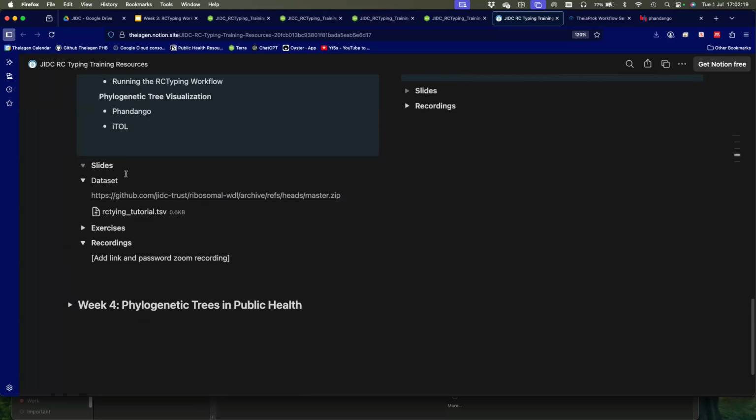Hi, Rotimi. You missed my question. I typed it on the chat box. Whether we might use this for speciation. Well, of course, because this is conserved across different pathogens, I would expect that, yes, you would use them for undertaking speciation analysis.